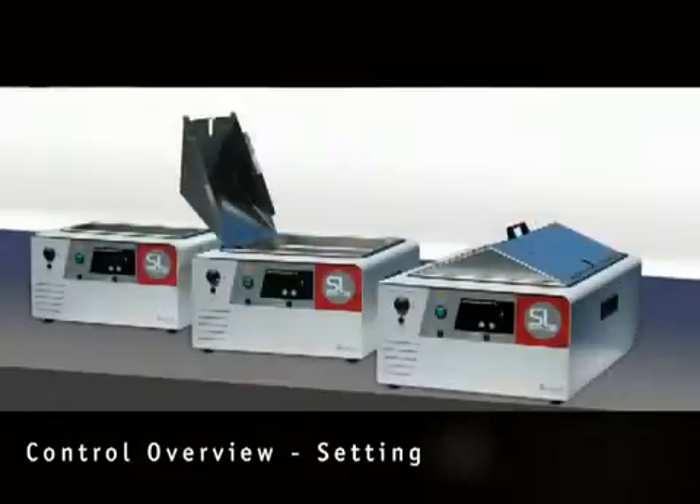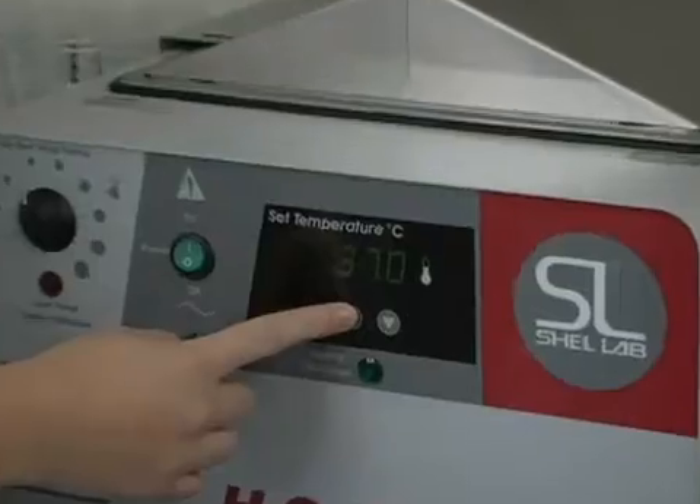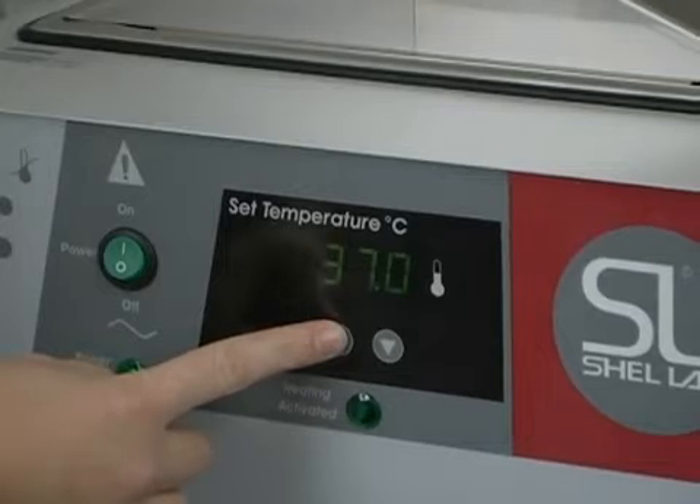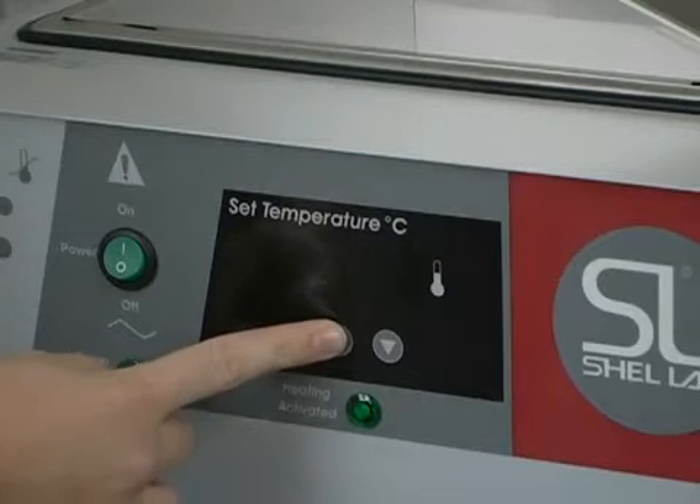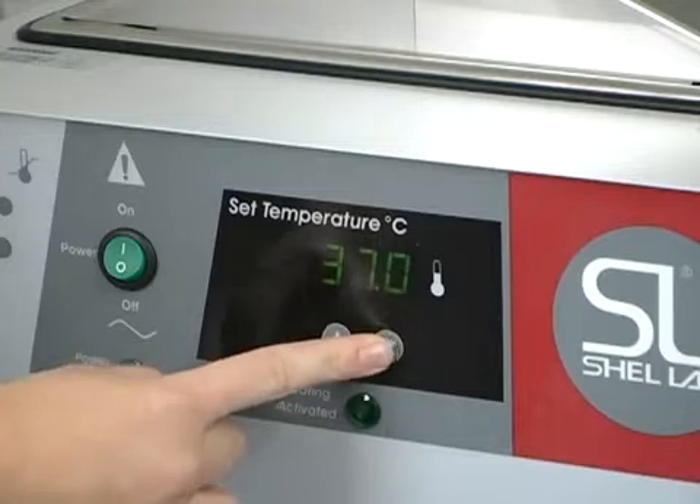To set the temperature of your Shell Lab bath, press the up or down arrow once. You will see SP flash on the display, indicating that you can change the set point. While the lights are still flashing, use the up or down arrow key to set the desired temperature. After three seconds, the set point will stop flashing and the bath will resume normal operation and adjust to the new set point.